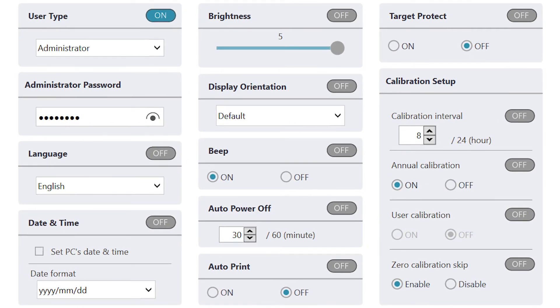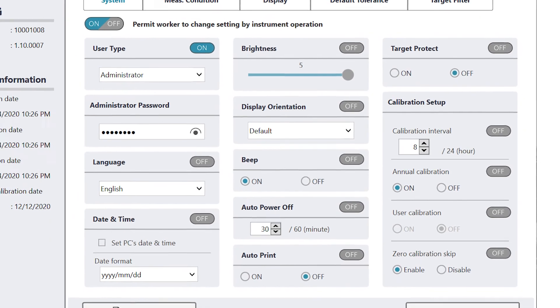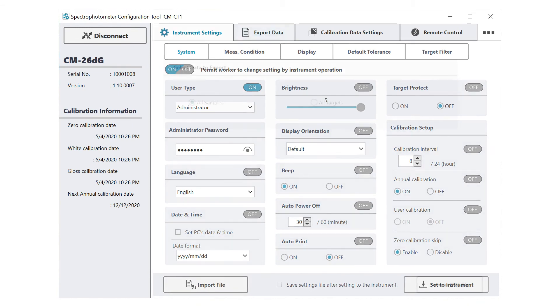Additionally, you can save these settings as a file and send to other locations using the CM26DG so that you can manage all units within your company's fleet. This will assure the same parameters on all units and eliminates any misperception of color data within your processes.